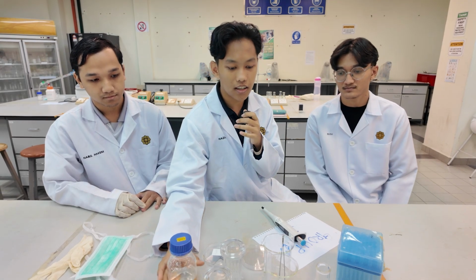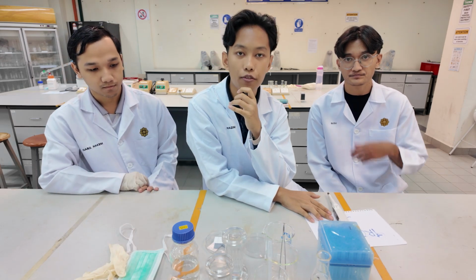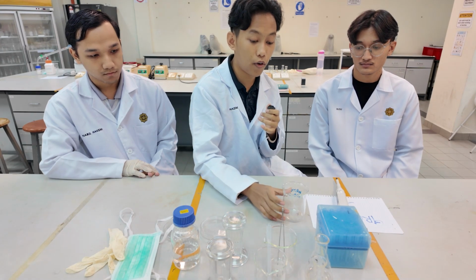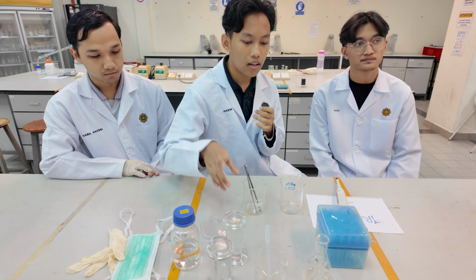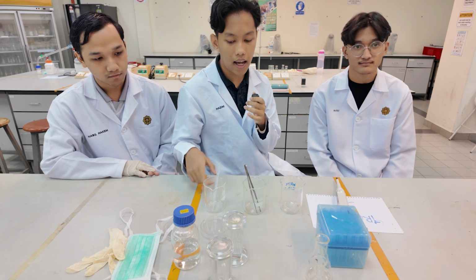As you can see, we gather it all in one place. First, we have 3 beakers that we label: first for acid, second for base, and the last one for neutral. We can label them as A, B, N.